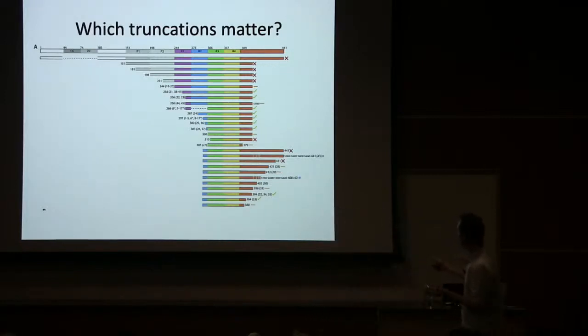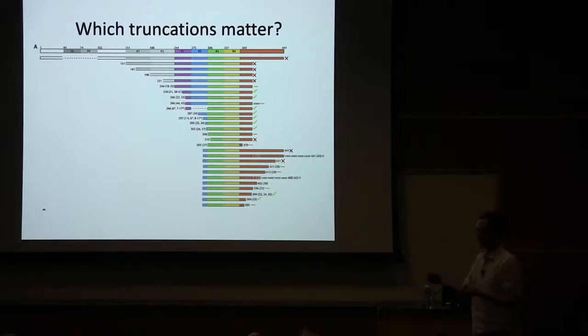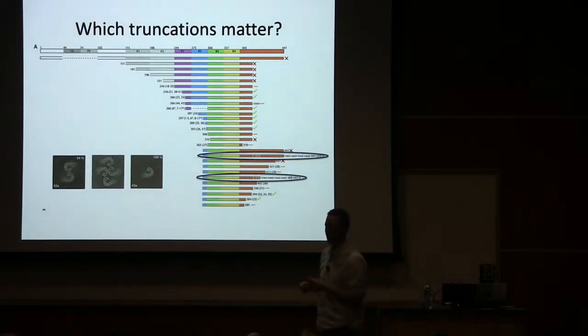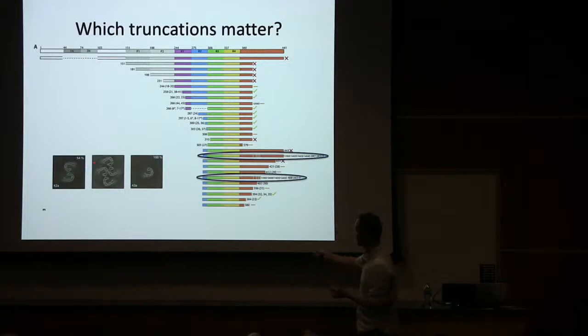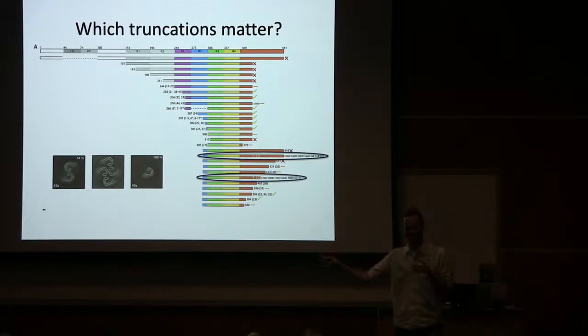But in the C-terminus, she'd looked at a paper by Judith Steen, who'd used mass spec to identify post-translational modifications that occur on tau in Alzheimer's disease, and she said, oh, there's these four that I would like to look at. So she made phosphomimetic mutations of her tau construct on the C-terminus, and then she could get filaments from the full C-terminus construct just by including these four mutations, and they don't form PHFs, but they do adopt the C-shaped protofilament fold from Alzheimer's disease, but they come together in different ways or they stay single protofilament. So not yet beautiful PHFs, but we now think that post-translational modifications in the fuzzy coat can actually affect what type of structures you form in the ordered core.